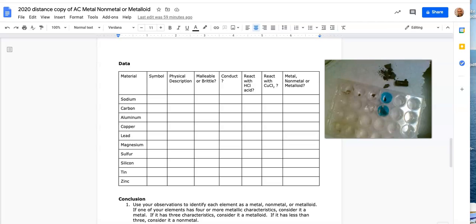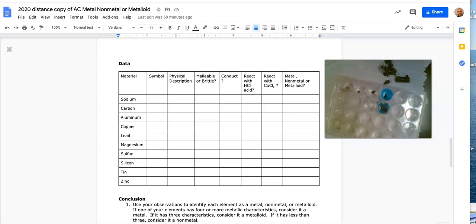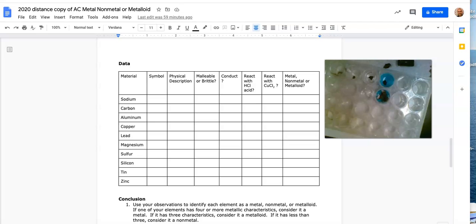I am noticing a reaction right away. Maybe you can see the bubbles in there and it's changing color. So we're getting a pretty obvious reaction with the aluminum. What's actually happening is the aluminum is swapping places with the copper that's in the copper chloride. So the aluminum foil is actually turning this coppery color as it swaps places. Copper is kind of getting deposited on that foil. And I wanted to take a look at the carbon here. I'm not seeing any reaction from the carbon from earlier.